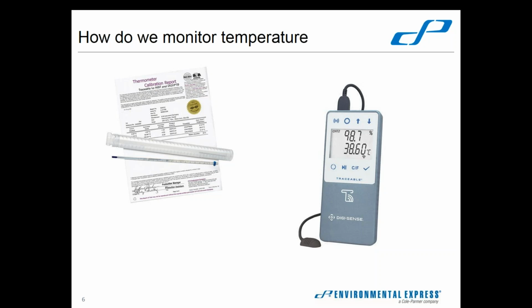Most of you, probably your QA officers, have a NIST traceable thermometer in each of the appropriate ranges depending on what you're monitoring: the sub-freezing temperatures, the refrigerated temperatures, the approximately ambient to a little warmer than ambient temperatures, and then the really hot temperatures, boiling and above. So usually they've probably got those kinds of ranges, and they've got special NIST thermometers that cost a lot of money, and they're probably kept under lock and key so that none of us clumsy analysts get our hands on them and accidentally break them.